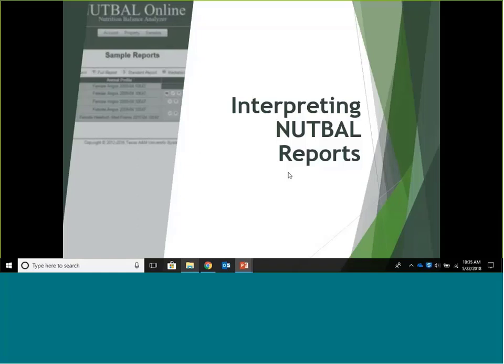Okay, so after you've submitted all of your sample information and we've analyzed your sample, I'm going to go through how to access some of your sample information online, and then we'll start there, and then I'll go into actually breaking down the NUTBAL report and how to interpret it and then how to apply it.